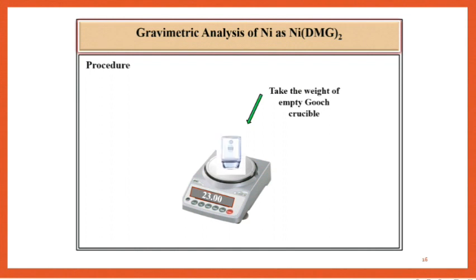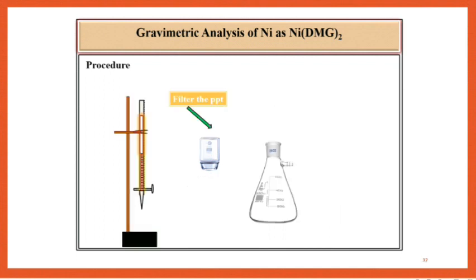Meanwhile take the weight of empty gooch crucible, record it in an observation table, and then filter the solution of nickel DMG through the gooch crucible. Thereafter wash this precipitate by using hot water. Give the washing for 2 to 3 times.